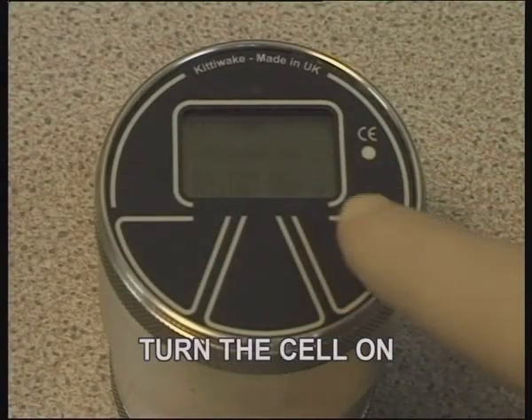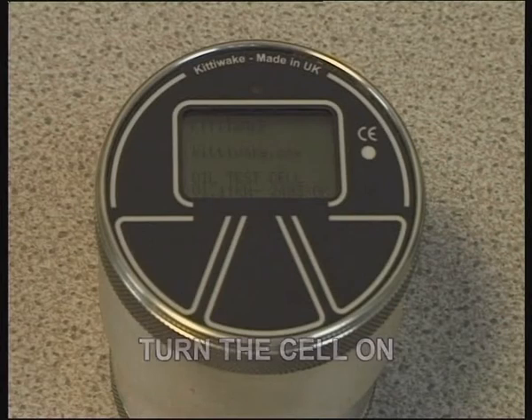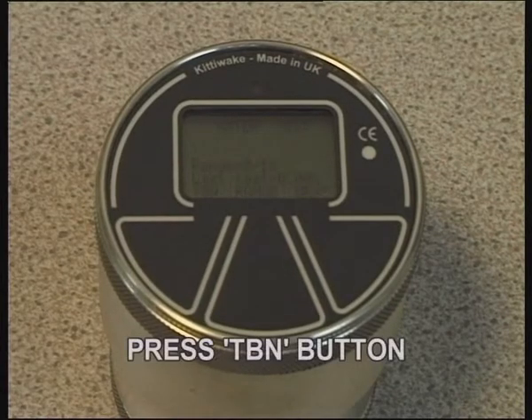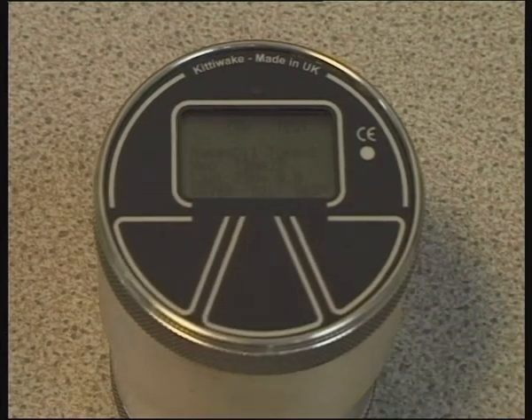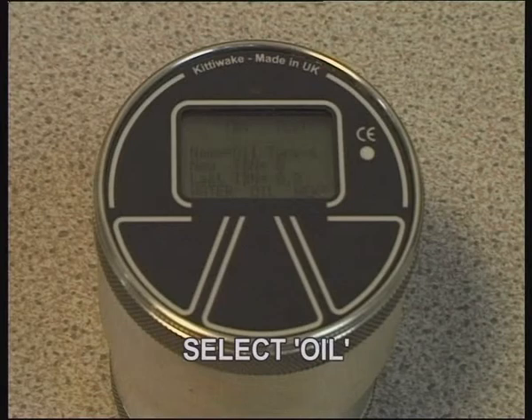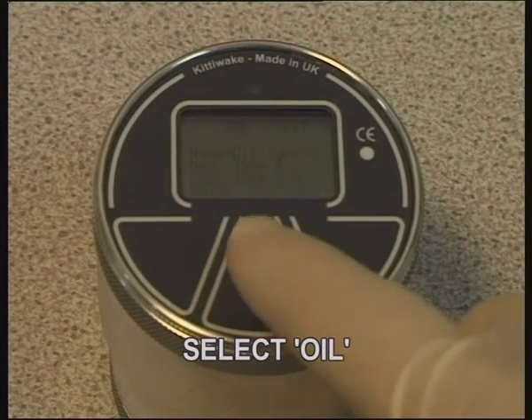Press the right-hand touchpad to switch the cell on. Press TBN to switch to the TBN mode. Select the oil to be changed or edited by pressing Oil.